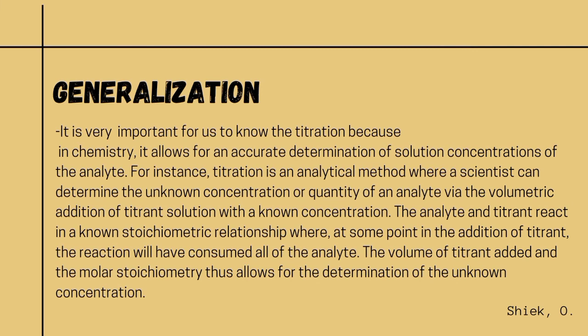The analyte and titrant react in a known stoichiometric relationship where at some point in the addition of titrant, the reaction will have consumed all of the analyte. The volume of titrant added and the molar stoichiometry thus allow for the determination of the unknown concentration.